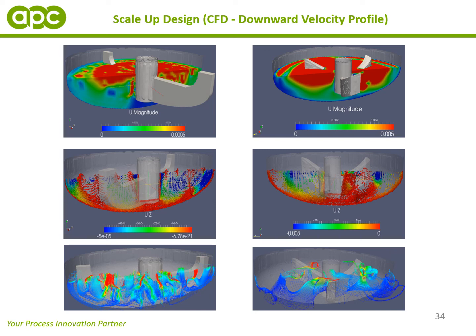And looking at the retreat curve impeller, it looked to be a lot more well mixed. There were no regions of hold up or dead zones. And from the CFD, we felt that the retreat curve impeller might be a more useful configuration to use at scale.